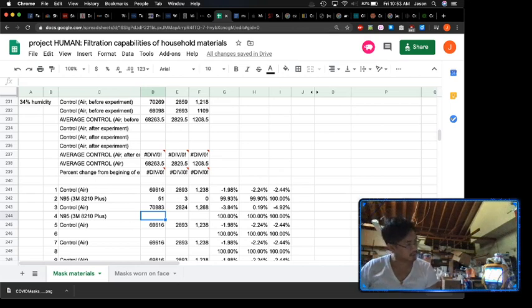See, what's interesting is that if I don't seal it correctly, or maybe it's because it's on the seam of the mask, there's definitely way more particulate. I mean, not a lot, but I put it on a different part of the mask.